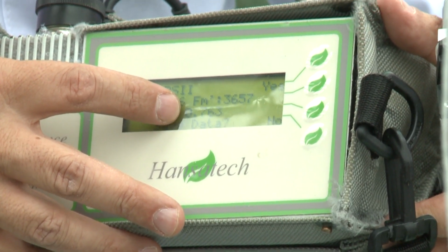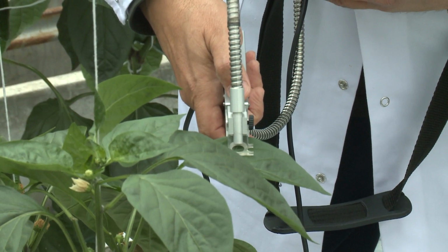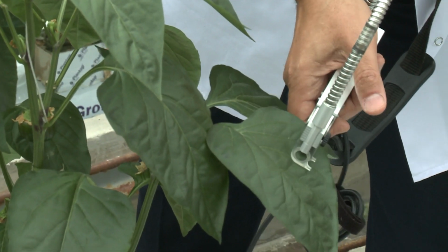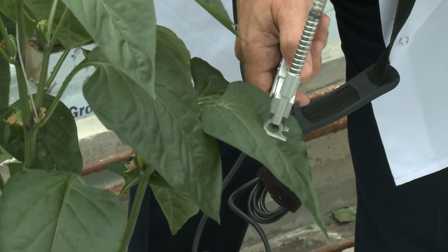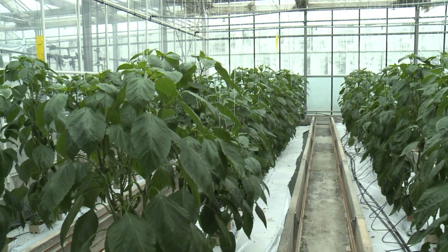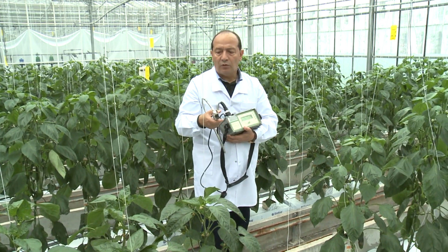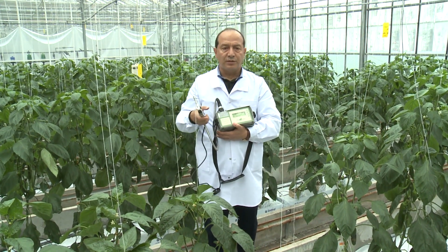So in 1 second, we come back to our next plant or next leaf, and we can save that one, and we can do next measurements. And again, we take older leaves, you push the button, and we save, and we collect our data from one plant. Next plants, make many repetitions here in the greenhouse or in the field or in the forest, whatever, and then make the mean value of these parameters, and then we understand what is the physiological status or the conditions of our plants.